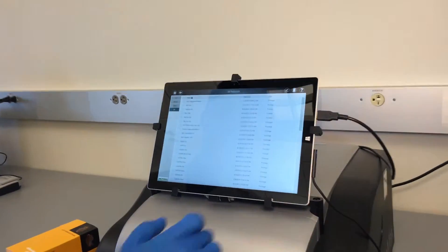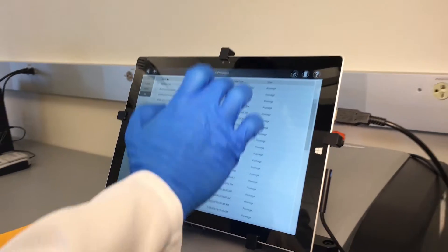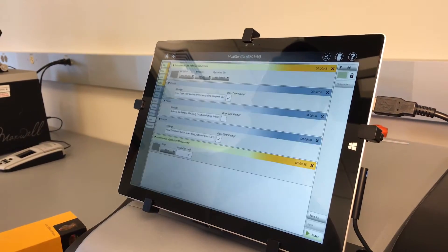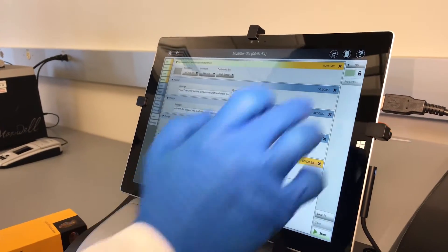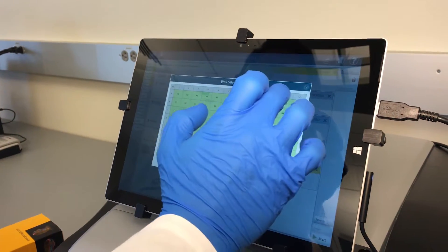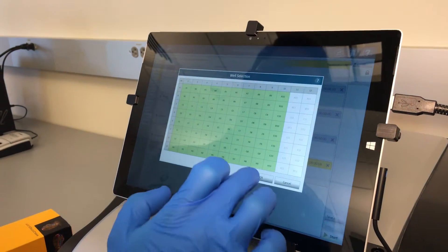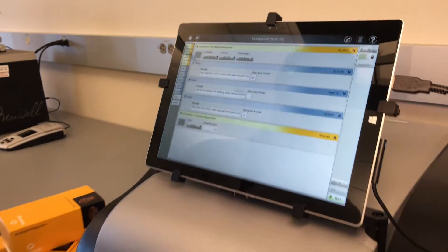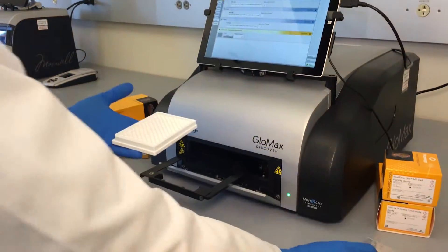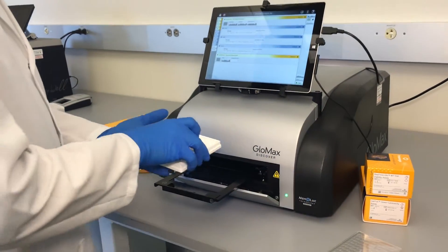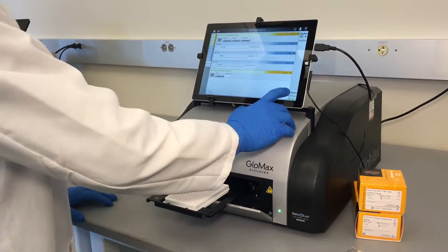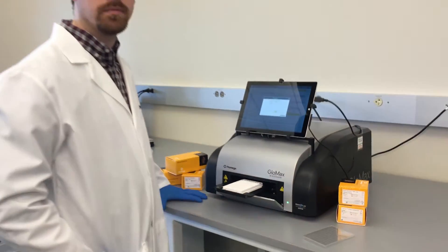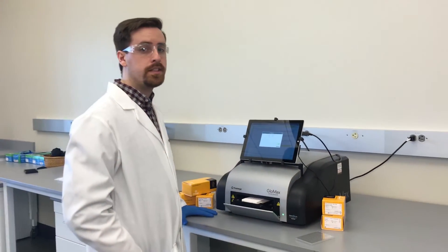Here's how you do it. We go into protocols, scroll down to MultiTox-Glo, select the wells that we want to read, hit the door, add our plate, and hit start. That's it.